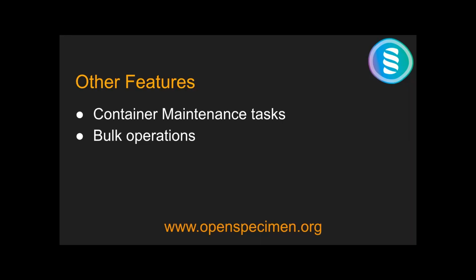In all such cases, for whatever periodic or pre-planned activities, OpenSpecimen gives you an option to create maintenance tasks. You can assign these tasks to specific users, and the system will also send reminder emails that Brandon needs to do freezer maintenance tasks on this date between this and this time, and he will be notified one day earlier or something like that. So all such container maintenance tasks can be configured with the system.